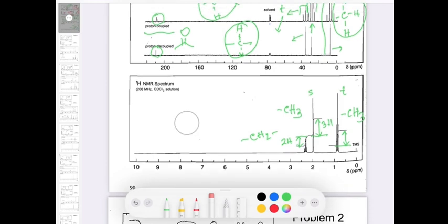First of all, we have a carbonyl group, one degree of unsaturation, from the IR, the carbon NMR and this proton NMR. In this proton NMR you will not get any information for the ketone group. Now you have to put a methyl group, which is giving a triplet, which means it has 2 hydrogens as neighbors.